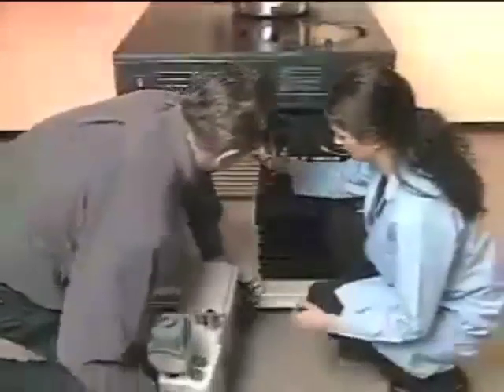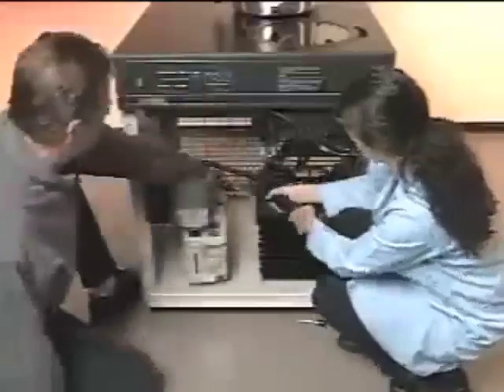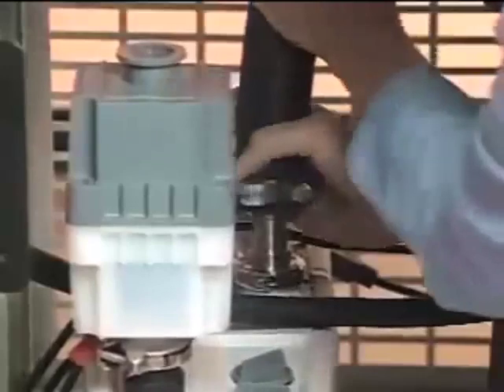Now you're ready to connect the vacuum pump to the system. If you have a LabConco rotary vane pump, it easily fits inside the cabinet. Connect the freeze-dryer vacuum hose and inlet adapter and tighten the clamp.